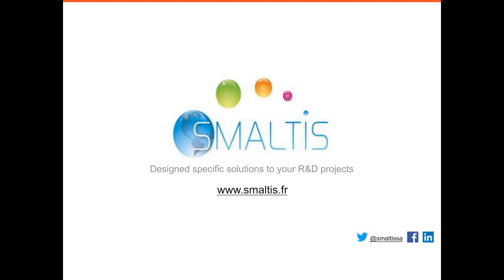That means we can perfectly record and archive the images automatically, but the whole analysis process must be done manually. We save the images in a convenient way, so that allows you to click through all the images very conveniently, but there is no overview about the whole plate per day.